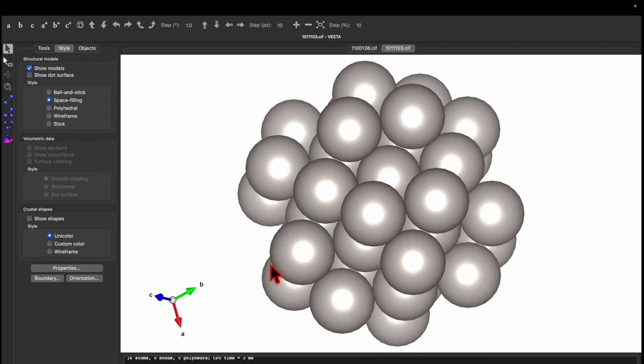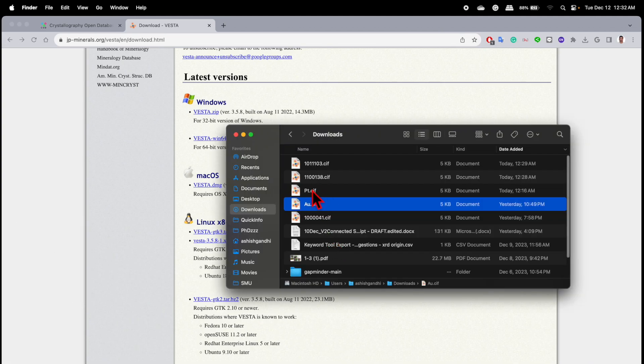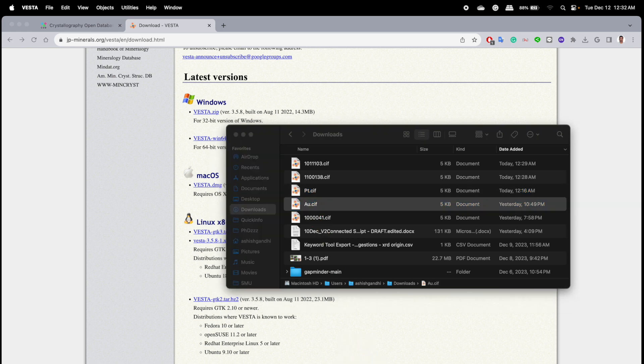Now I will show you step by step. First, go to the download folder. Here we have the CIF files for Au and platinum. Drag the Au CIF file into the VESTA software.